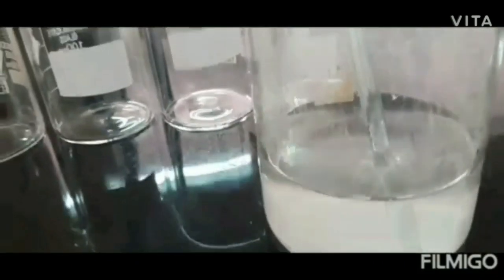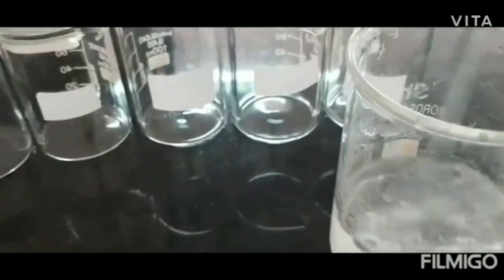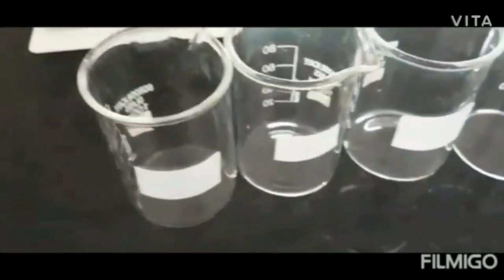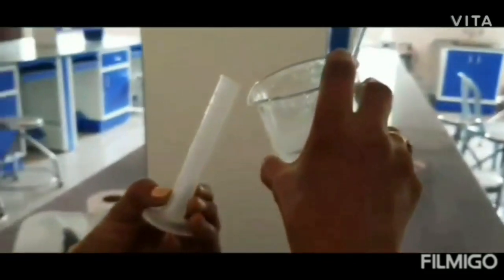Now the solution is transparent, so it has to be kept aside to cool down to room temperature. When it is cooled, it is ready to prepare the other concentrations.